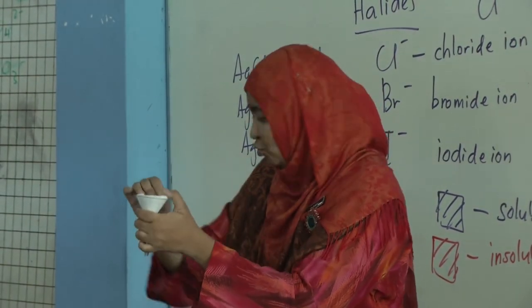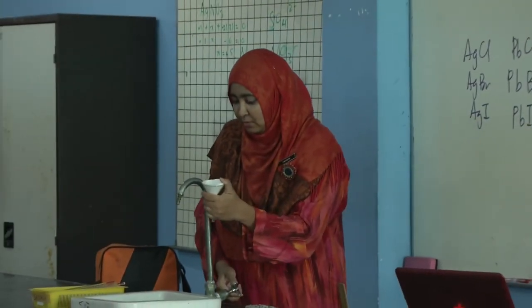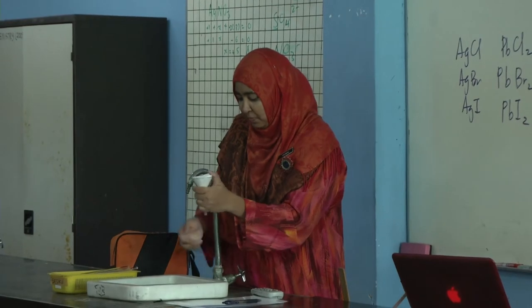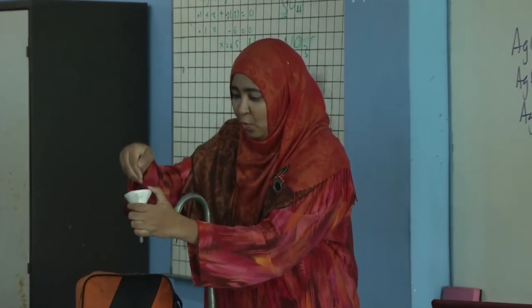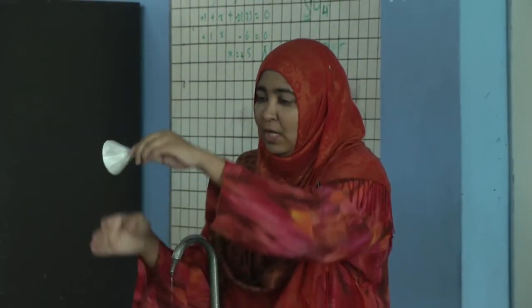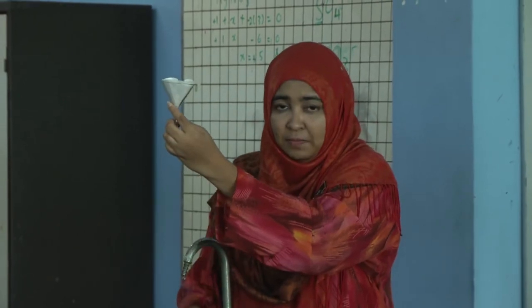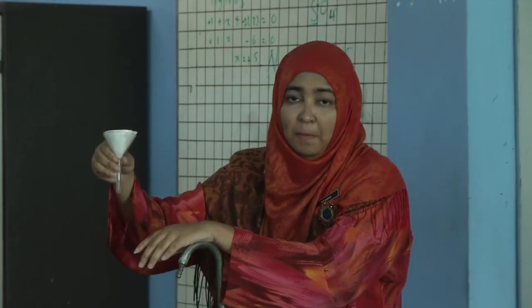So what I have to do is, I just have to sprinkle some water. Alright, like that. Okay, wet it. So use your fingers to wet it. And now it is sticking. Okay? Clear? Yes. And then this you place it in the beaker.